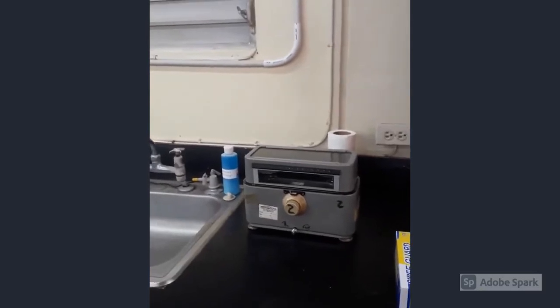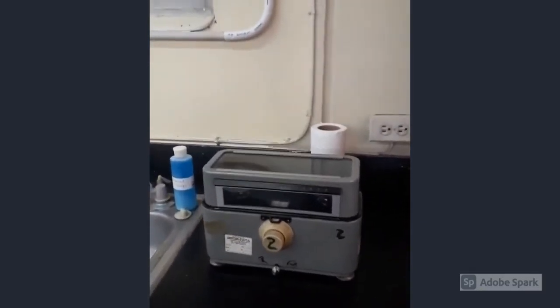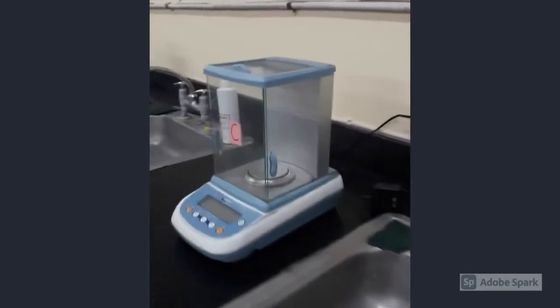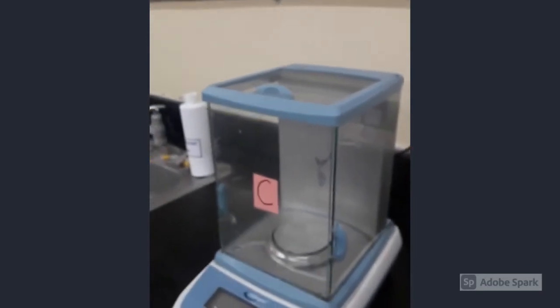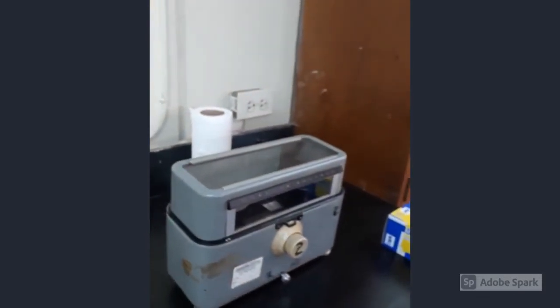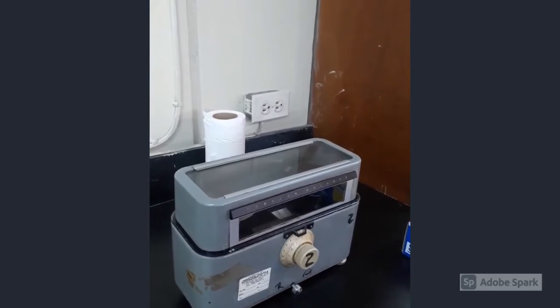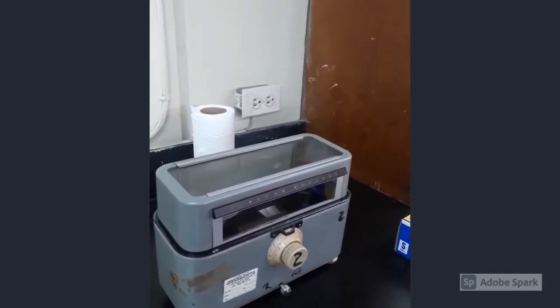For this dispensing and pharmaceutics lab, we normally have three types of balances that you would use. We have our torsion balance, our top loading balance, and our analytical balance. We have stopped utilizing the torsion balance, but we still allow students to see it, see where they're coming from, and how it is that you are supposed to use it and take care of both the balances that we are now using, which is the top loading and analytical.